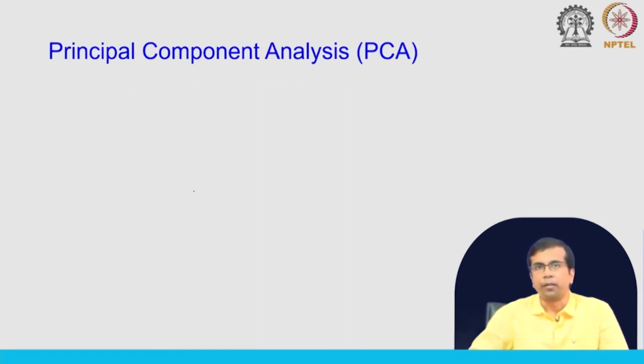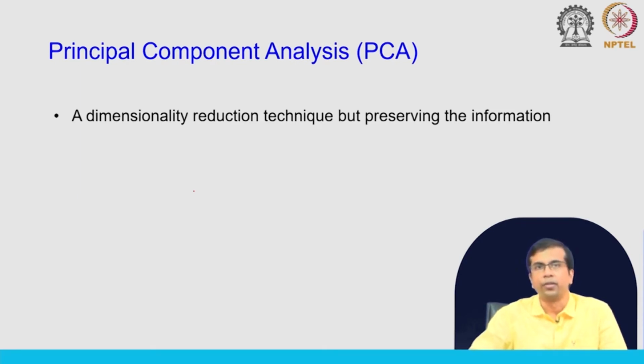So coming to the principal component analysis, or PCA. This is again not a very detailed discussion. I will just very briefly mention what we do in PCA, but you can find out a lot more, and there is a lot more elaborate analysis that you can do with PCA. This is a dimensionality reduction technique that tries to preserve the information that is present in the data. When I say dimensionality reduction, in our normalized count data we have counts for maybe 7,000, 10,000 or 20,000 genes.